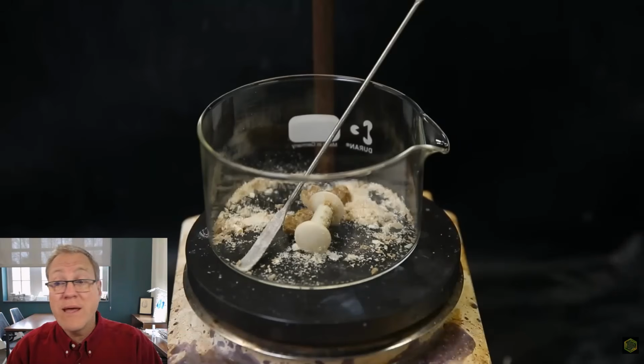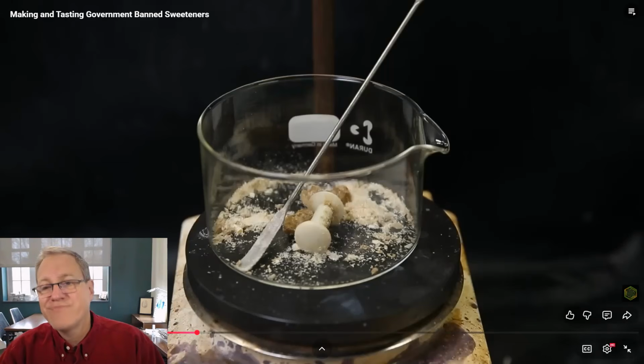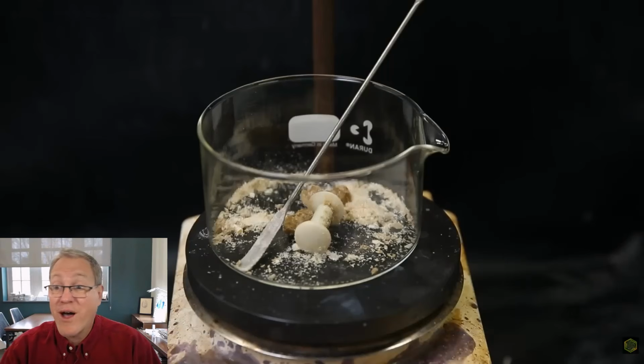Now, I'm not saying it's clean. I'm not saying it's up to his standards, but color alone is not the best indicator. But it's what we can see with our eyes, so we always focus on color. But it's really, that may be just fine.